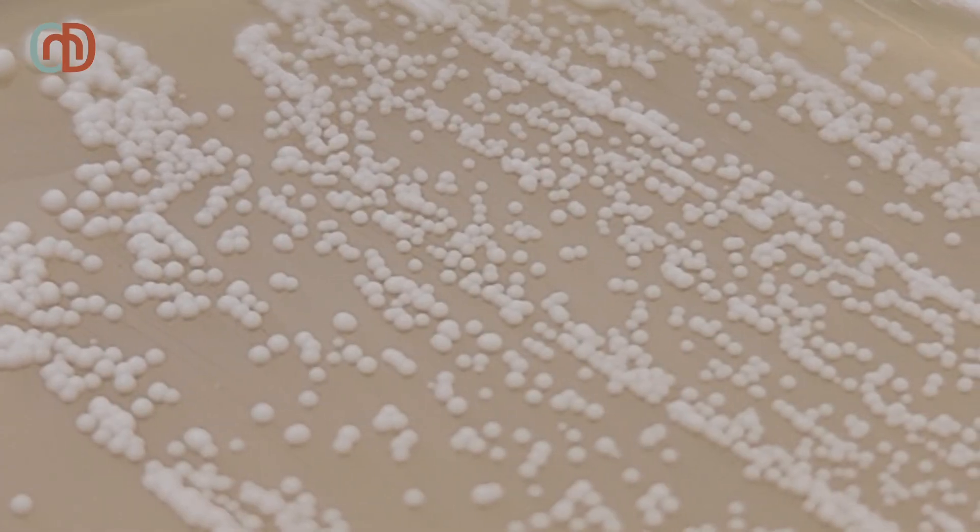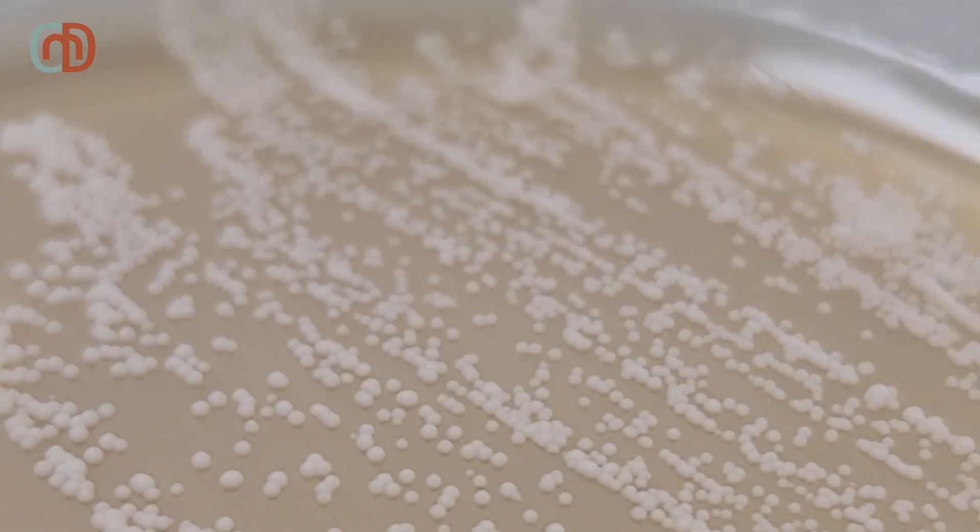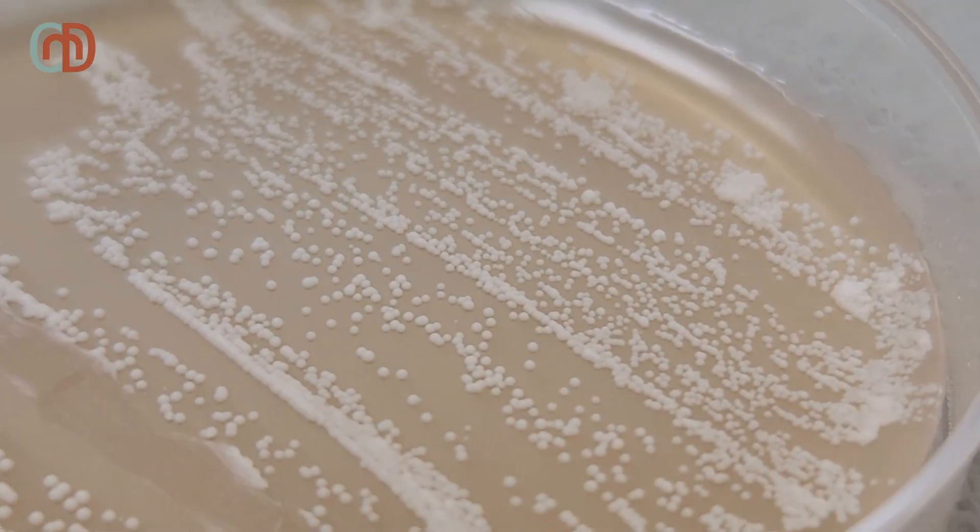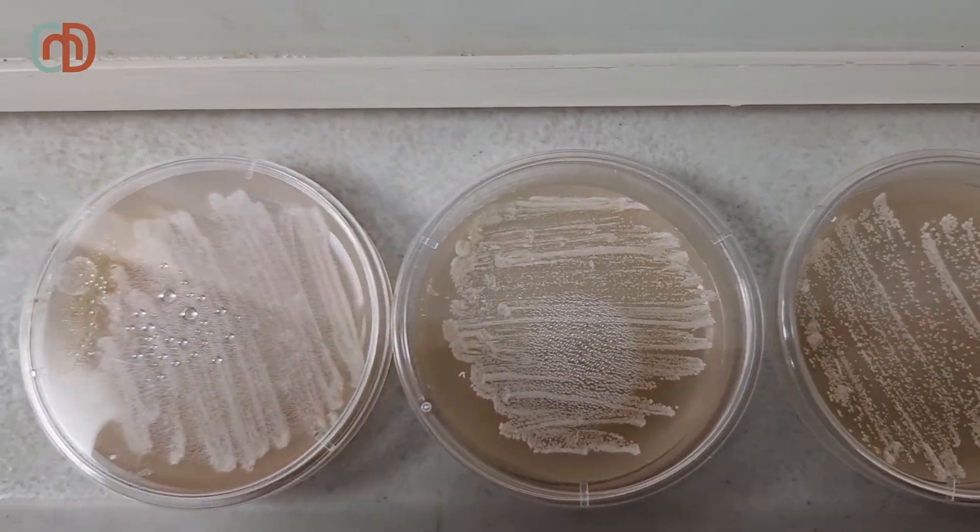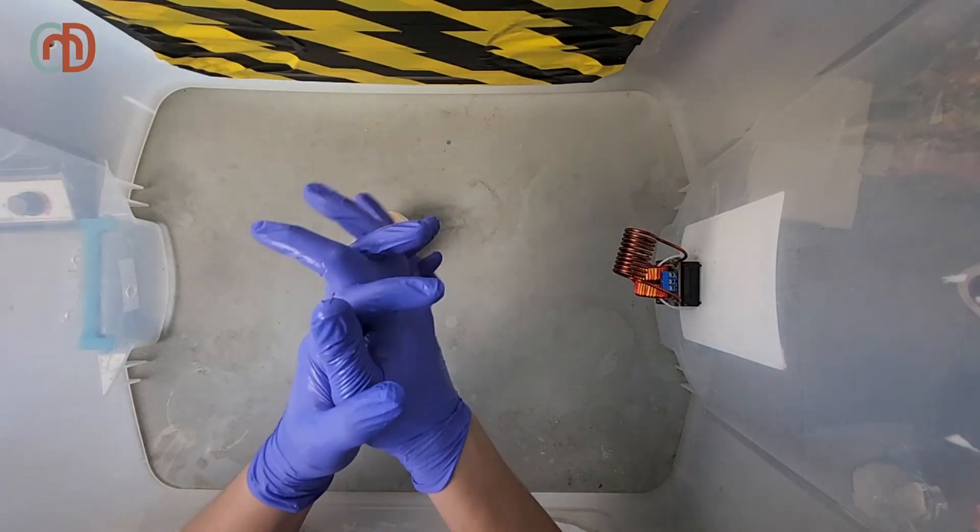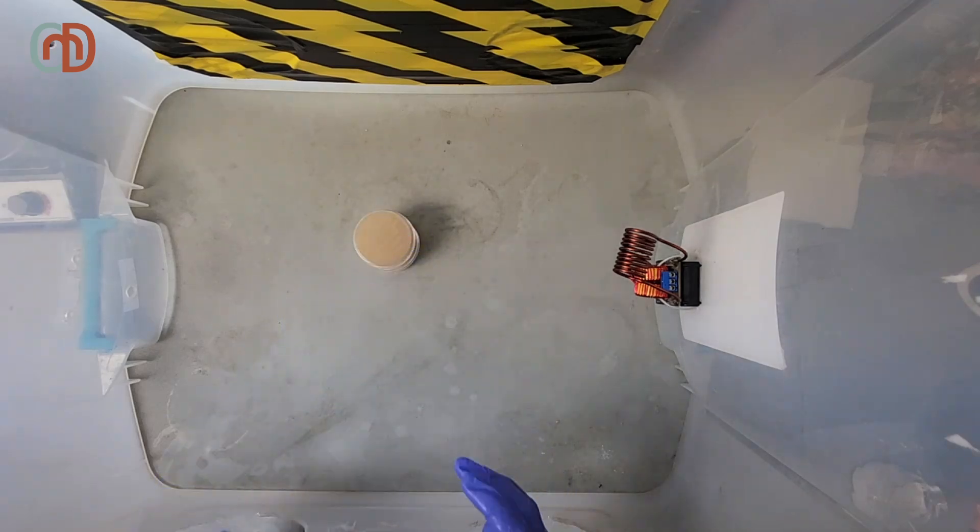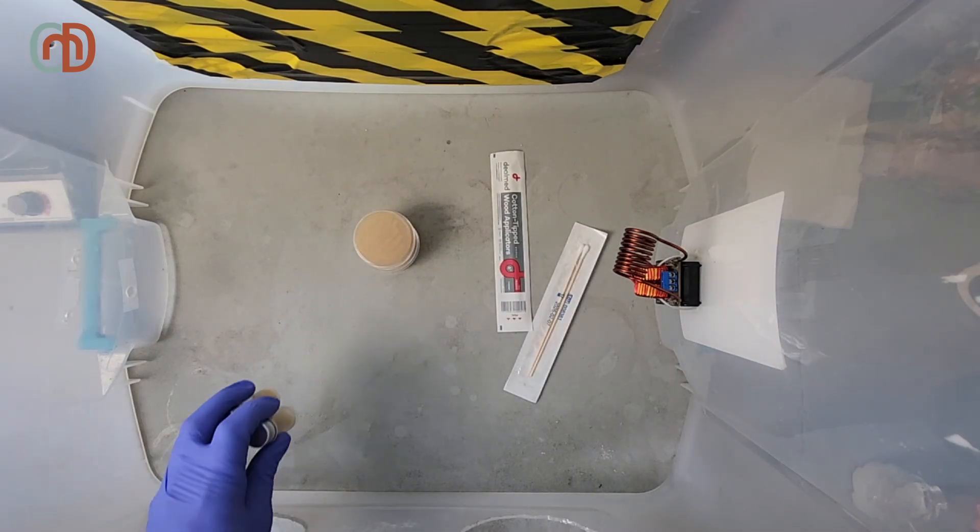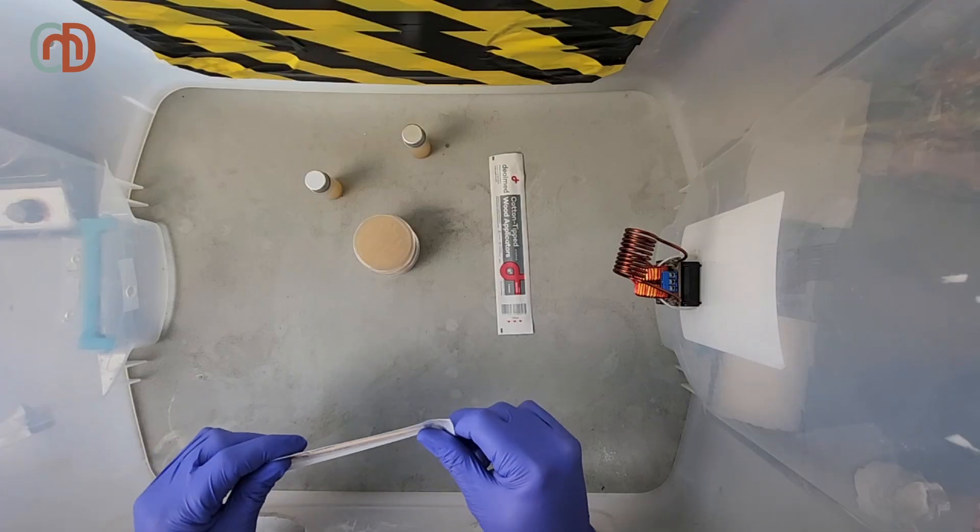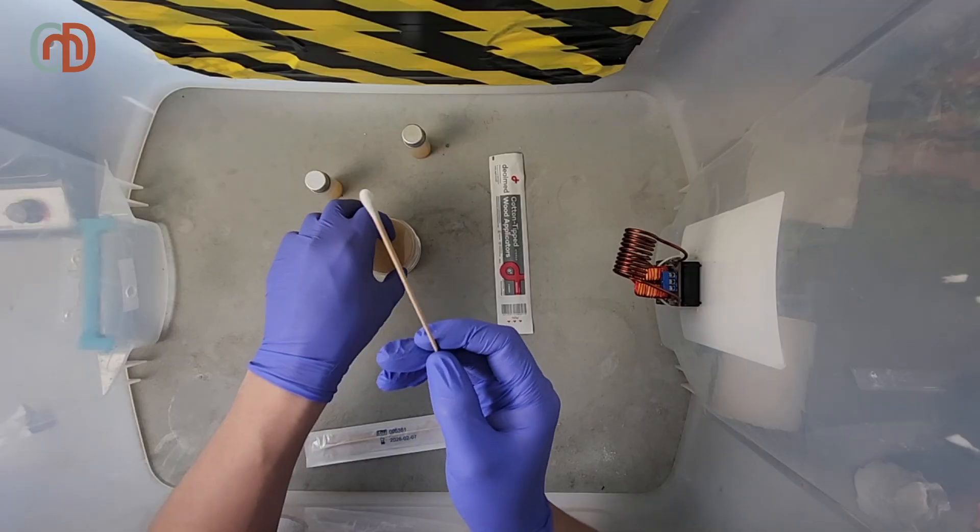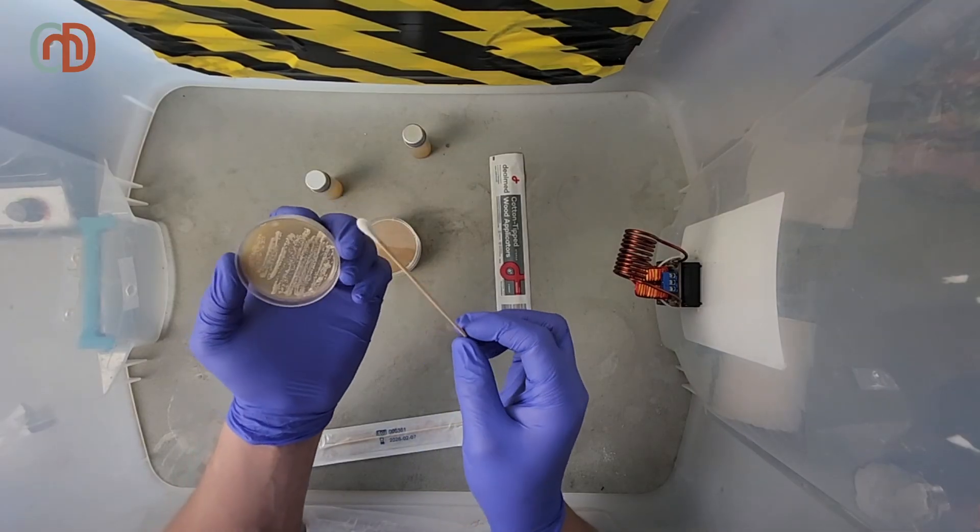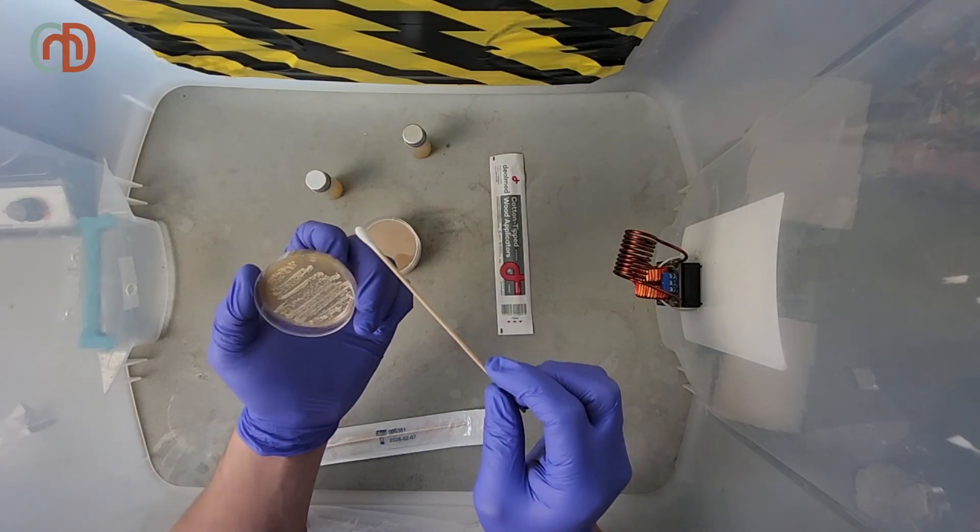After around 48 hours, I see some nice growth on the plates. Yeast should present as creamy and white and should not have any colors in it. These are some great examples of what healthy yeast should look like. I sanitize my hands, grab some swabs, and the slants that we'll be transferring yeast into.